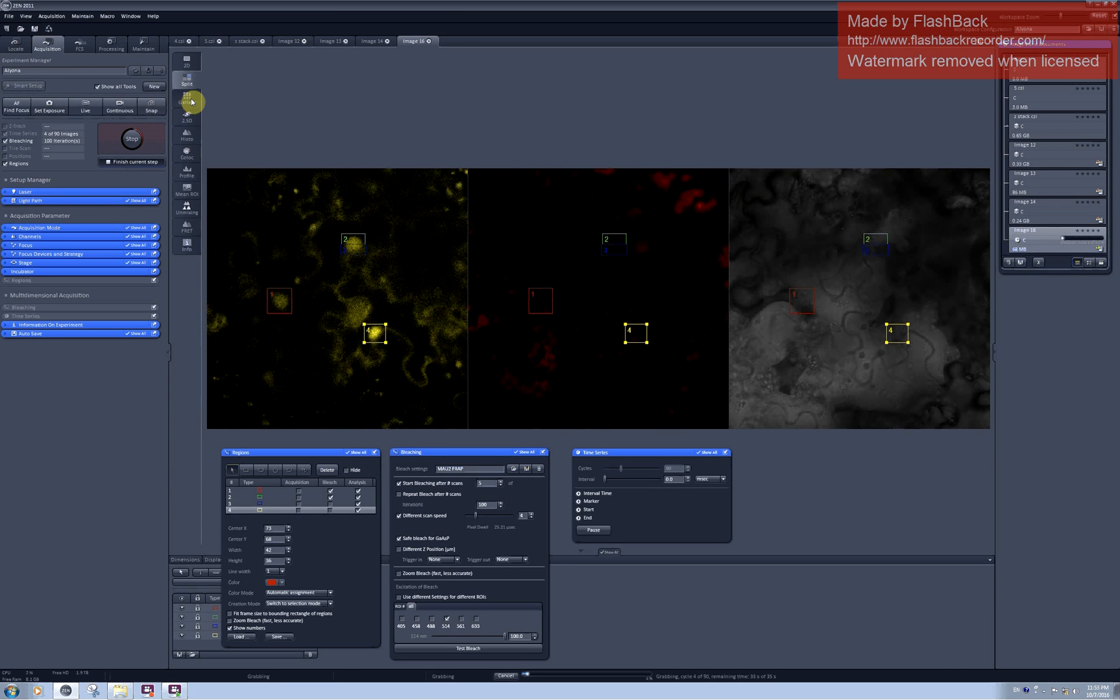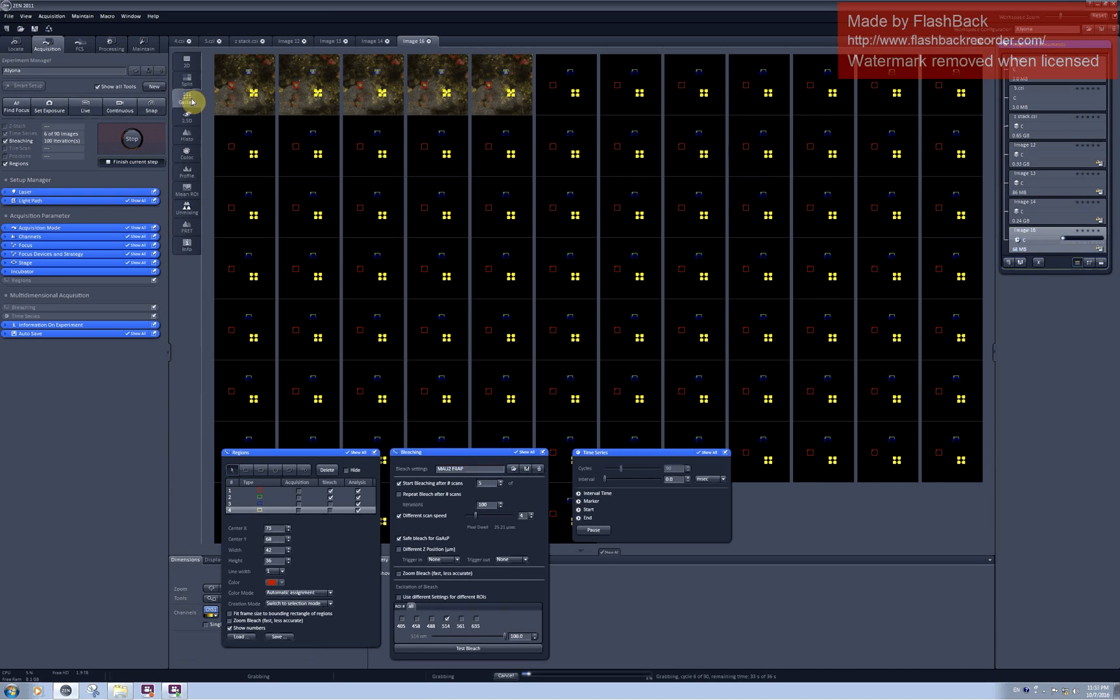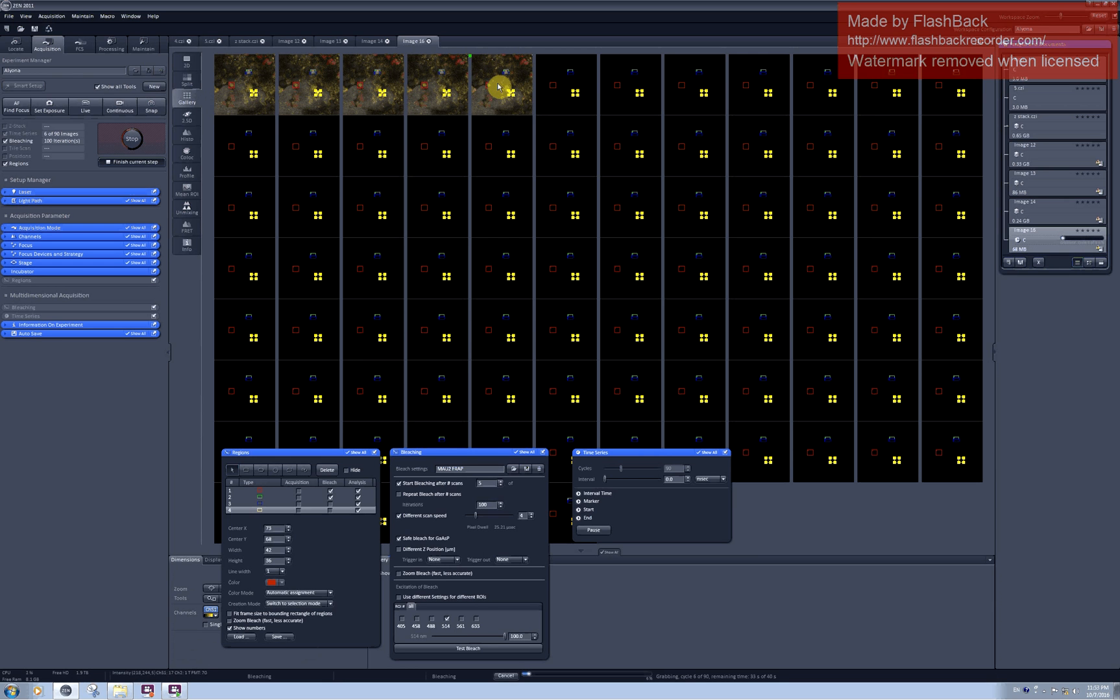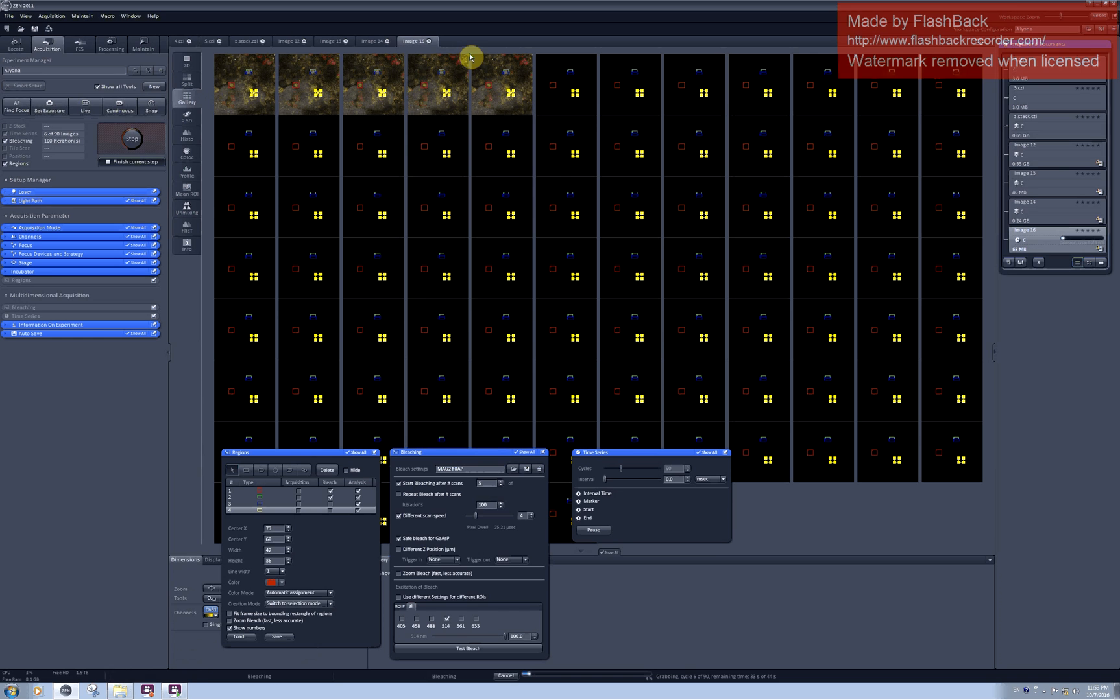And in the gallery I will see the progress of scanning. So these were the 5 scans before photobleaching which I asked for here. And now photobleaching happens.